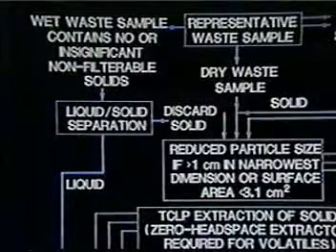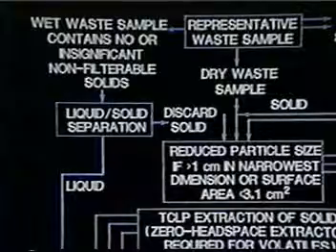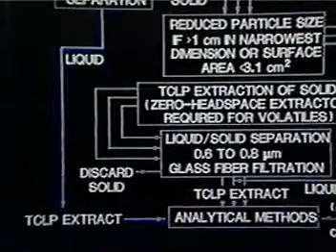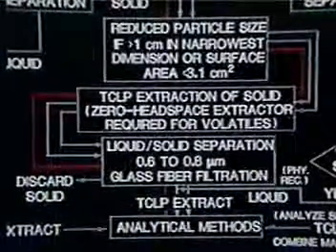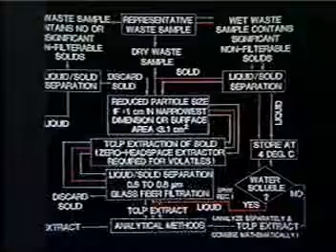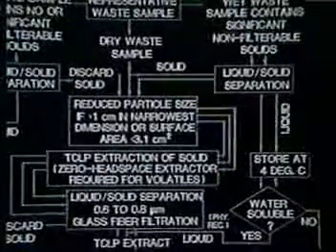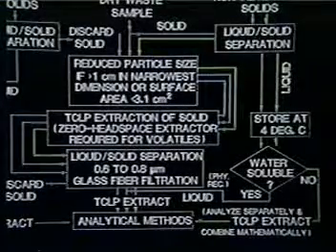In simple terms, the difference is that wastes which are liquid or contain insignificant amounts of solid do not have to undergo extraction, and after filtration are ready to be analyzed. When testing wastes which contain no liquid, one can dispense with the initial liquid-solid separation step and go directly to the extraction. Multiphasic wastes, however, require both types of treatment. An additional step may be required if the initial liquid phase is not compatible with the liquid produced in the extraction.